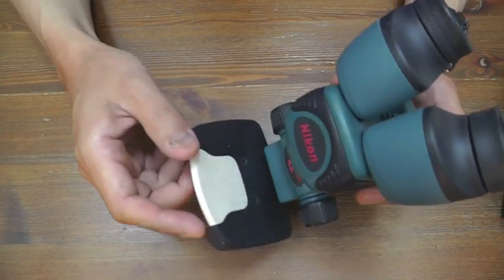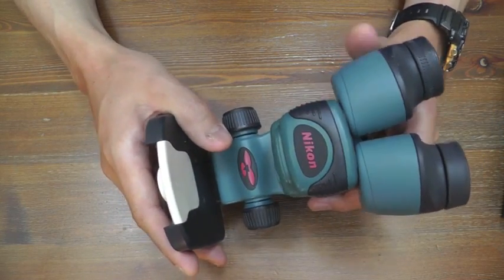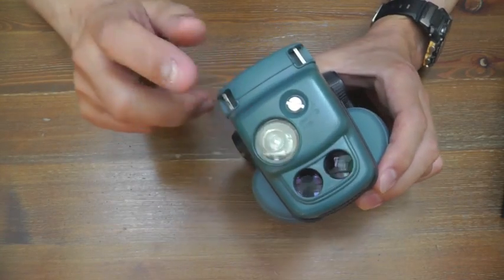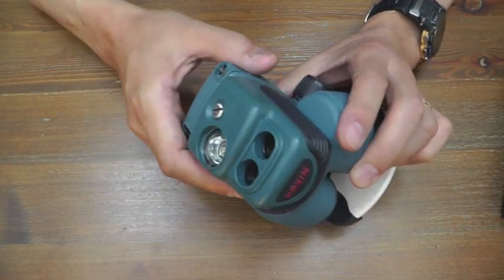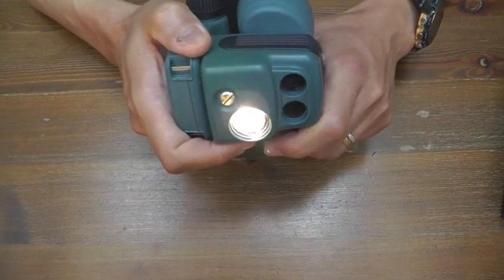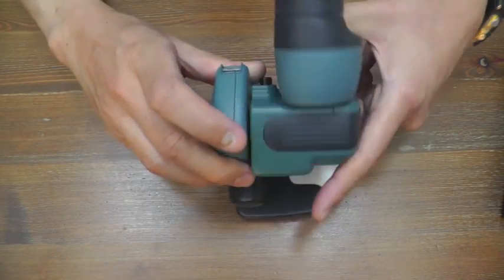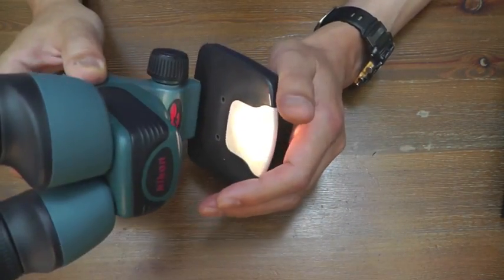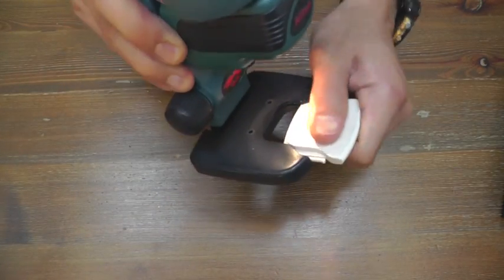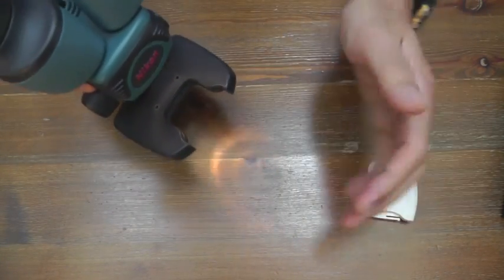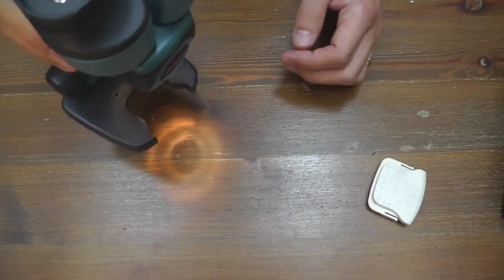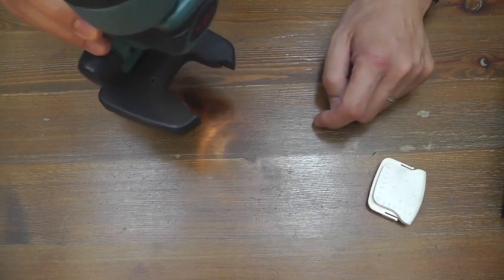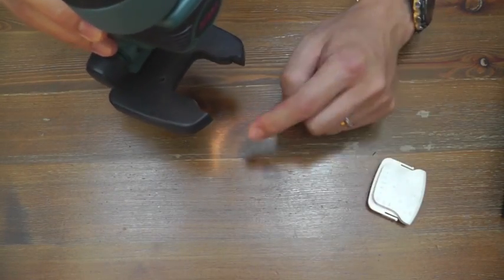It's a Nikon field microscope. It has a built-in lighting system, but it is not very good as you see. I hope you can see it. Dark hole and wing illumination. No good.